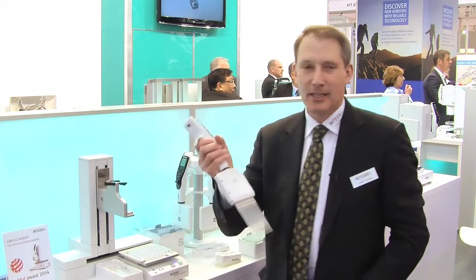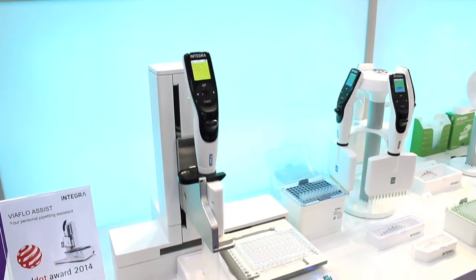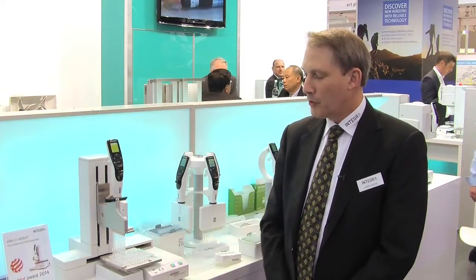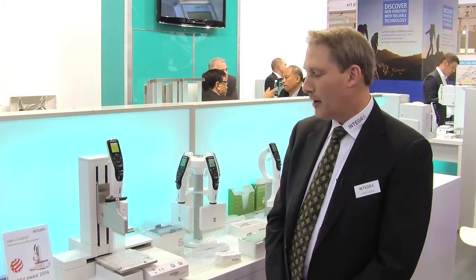The ability to program things is fantastic because anything you would do with your hand, you can have this robot do for you. The major applications are reagent addition or serial dilution. Once I've loaded the pipette on, I would manually attach the tips in a standard rack, load the pipette on the unit, hit the run button, and when this button blinks I would simply push it and let the pipetter do its work. What it's doing now is picking up sample from the reservoir, going to the first column, and we are doing a mix — so this allows us to do a serial dilution across the plate effortlessly.